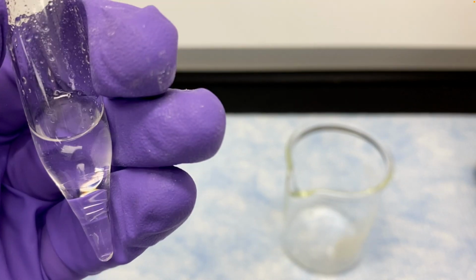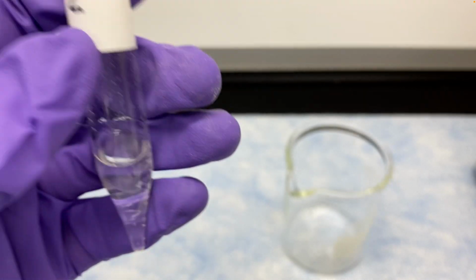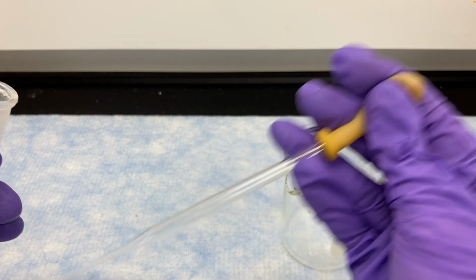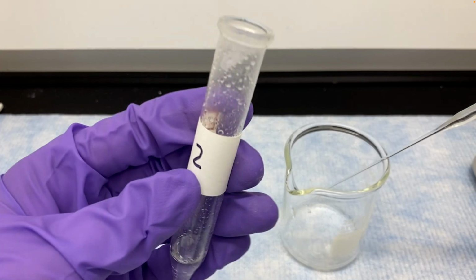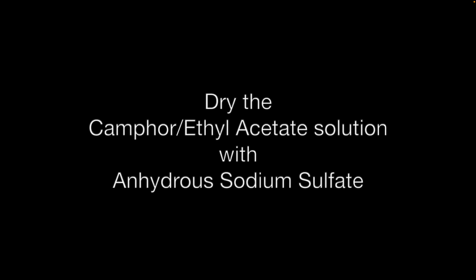Notice you're using 9-inch Pasteur pipettes with these centrifuge tubes because the centrifuge tubes are so long. Make sure to squeeze the pipette bulb before you put it in.